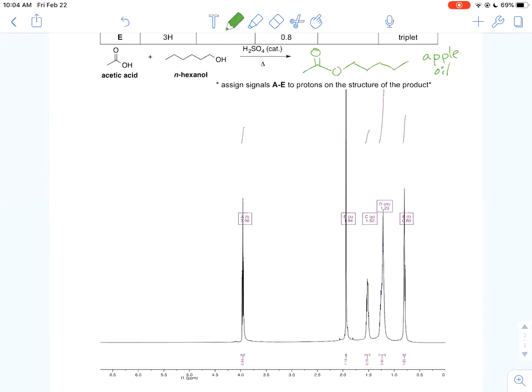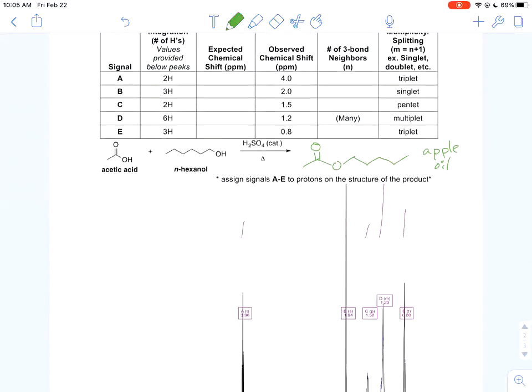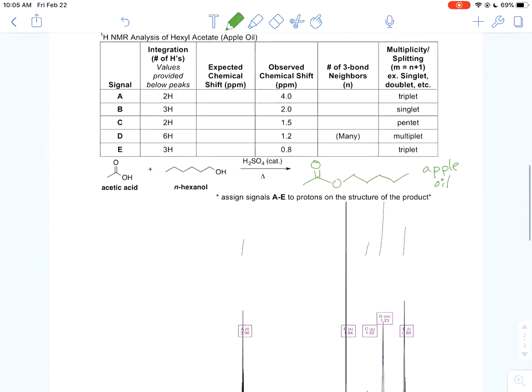What we want to do is figure out which signals on the spectrum match which protons on the molecule. I'm not going to fill out the entire table for you. This is the table that I'm referring to. You can find this table underneath the experiment 5 PDF on the class website. What I want to do is to highlight some differences in the spectrum just to make sure you can do the interpretation and then come to us for additional help.